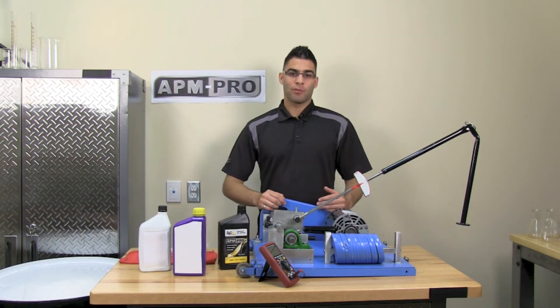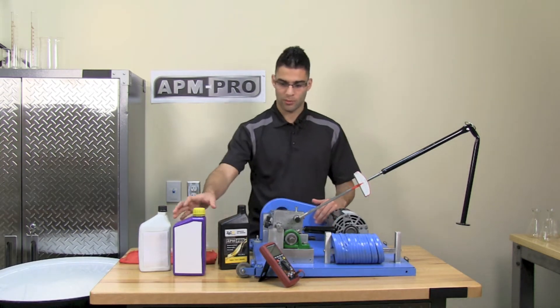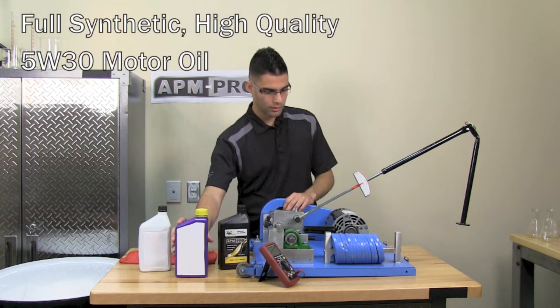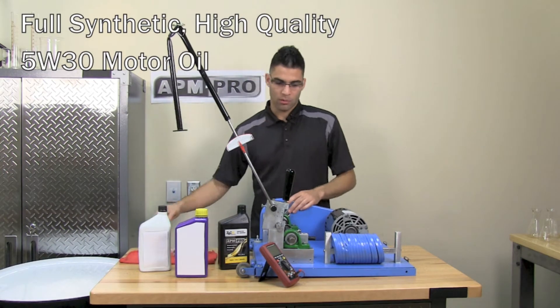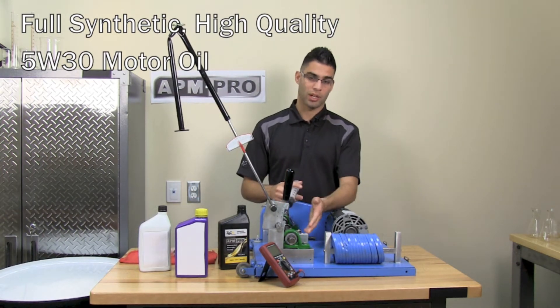We will then be adding one weight at a time acting as loads that will be simulating engines. We will be demonstrating how a fully synthetic high quality motor oil will perform in our machine. We will be using this one over here.